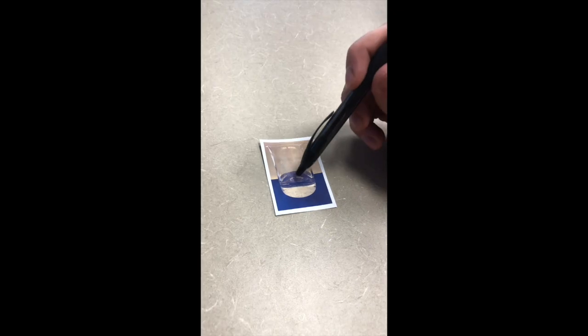So now we have the organic layer with the camphor inside. This mixture should not have any drops of water, otherwise we will need to remove them with a Pasteur pipette. So let's remove those water drops. Now we can add some granular drying agent, and we're going to swirl that around so that it collects and dries the mixture, separating the water from the organic layer. So we will start to see some of those clumps. And now we have to filter these from our desired mixture.